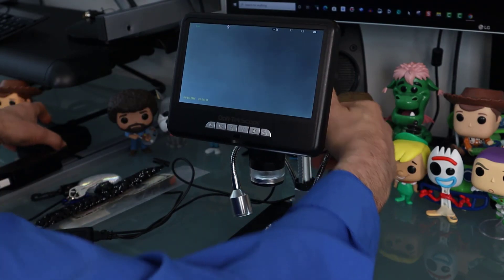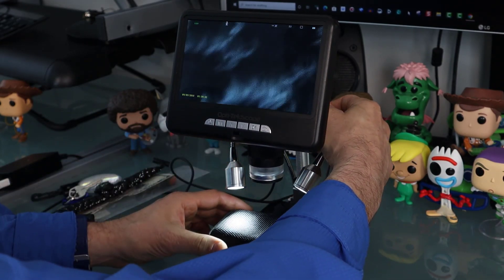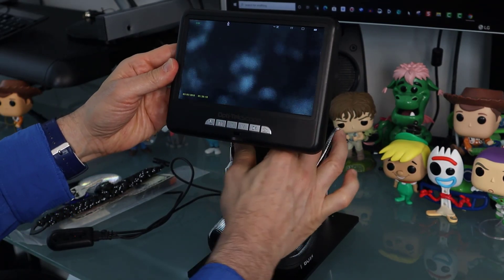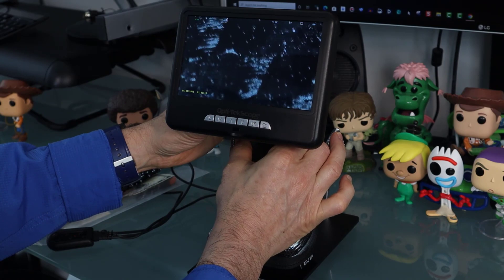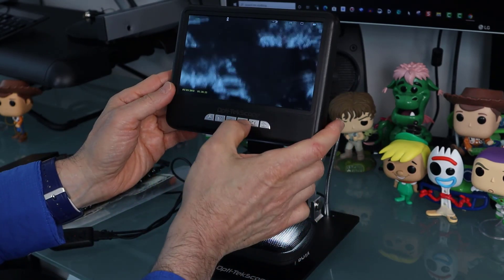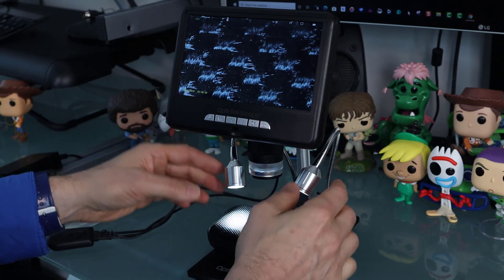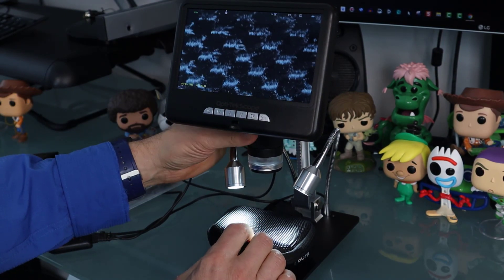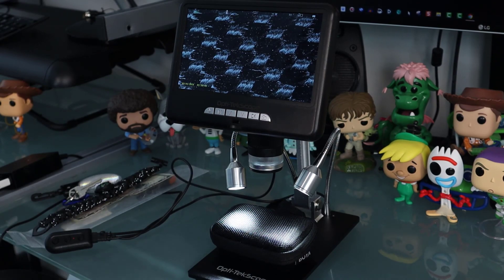The last thing I want to share is this case for a microphone. Let's take a look at this one. I have to go up just a little bit to get that clarity. Setting it to normal, you can readjust with the brightness and by raising and lowering the arm. Going up a little bit higher, you can see all the stitching that goes into this casing, and then you could dive in deeper there.